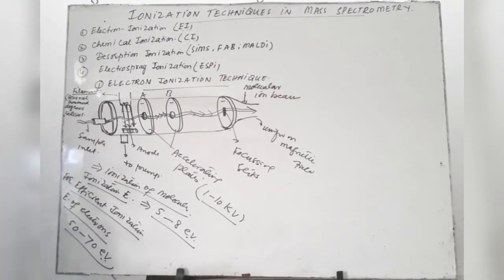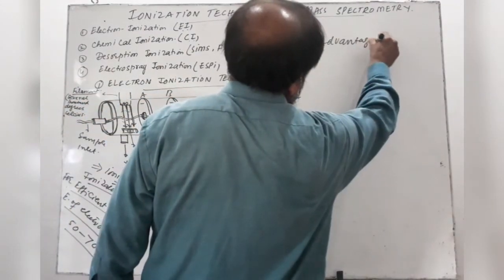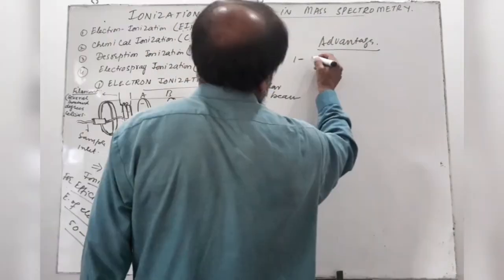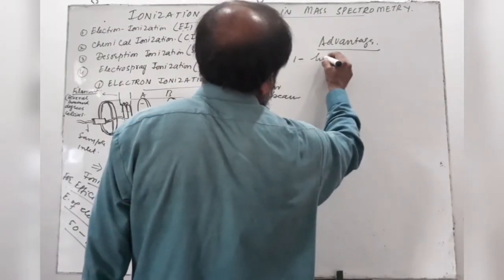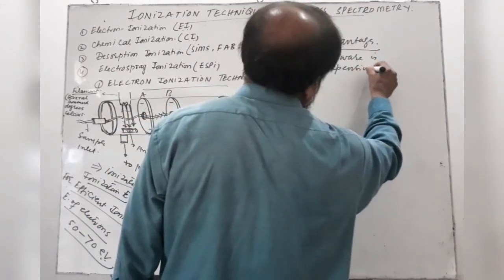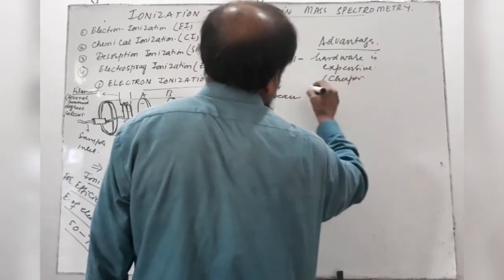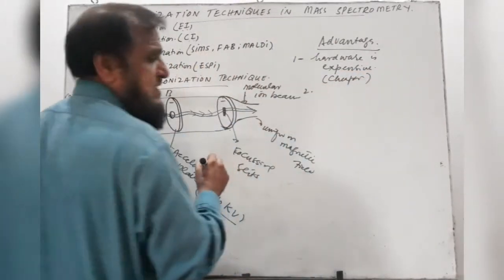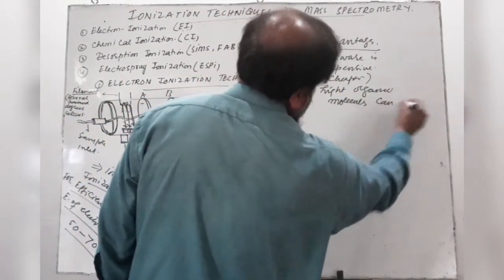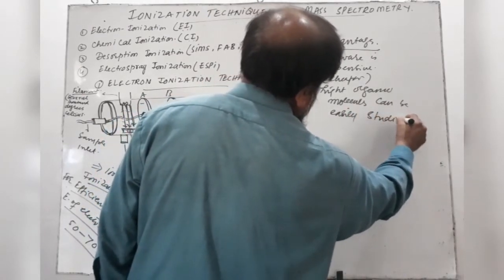This technique has three advantages. Number one, the hardware of the technique is inexpensive, it's cheaper. Secondly, light organic molecules can be easily studied through this technique.